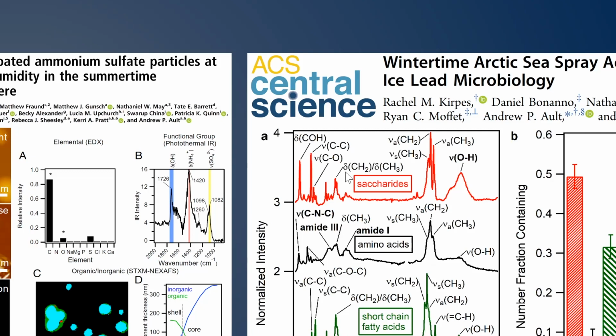And so you can see categories such as saccharides, amino acids, short chain fatty acids, long chain fatty acids, for these particles, where you can see in the electron micrograph over here on the right, a salt particle and then organic content kind of looping around it that had dried on that substrate. And this actually built on some really nice work by Rich Cochran and Vicki Grassian at the University of California, San Diego, the chi-squared analysis we did for these different categories of organic species.